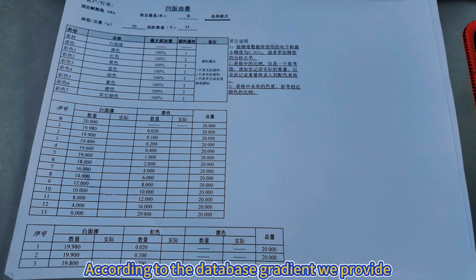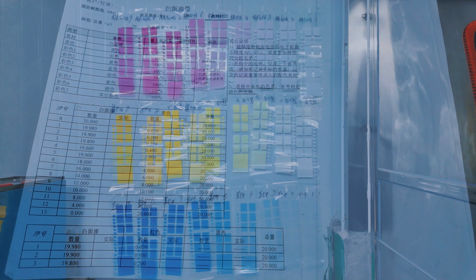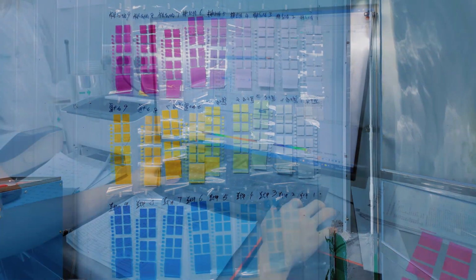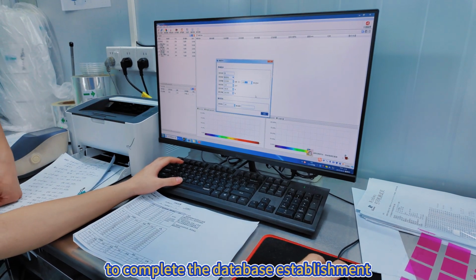According to the database gradients we provide: weighing, recording, diluting, stirring, proofing. Create gradient gradations of various base colors. Then enter it into the color matching system to complete the database establishment.